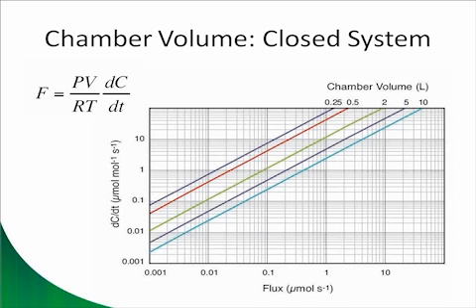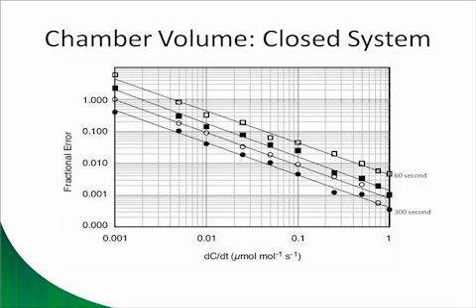Well, essentially, the larger the chamber, the more the signal that you're trying to measure becomes diluted. And this is important because at some point, if the chamber is too large, the signal will be on par with the background noise of the analyzer.